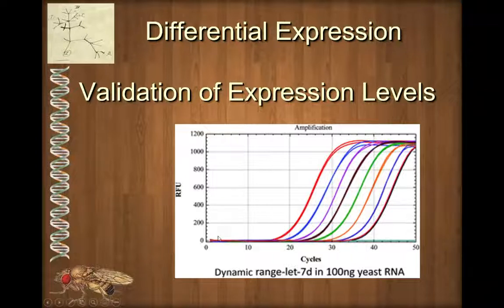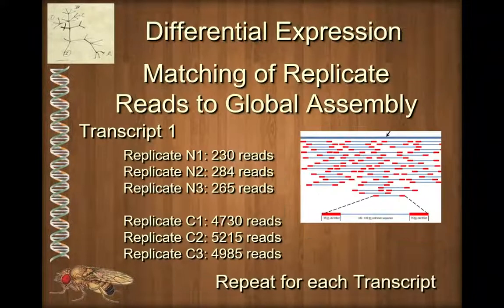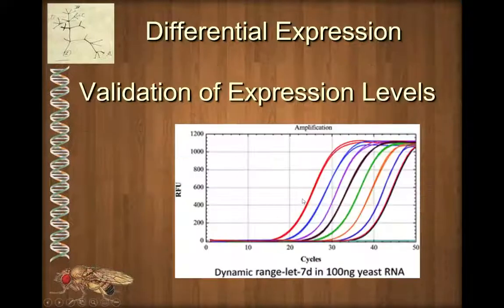So we could take an RNA sample and amplify a gene from that. And then based on when this begins to amplify, we can estimate the total number of transcripts in that beginning sample. And so this can independently verify the numbers that we're getting out. Like if we say one is 10 times or 20 times more common than the other one, well, we could verify that, yes, indeed, our qPCR results seem to corroborate, substantiate the levels of expression that are there in those two different samples.